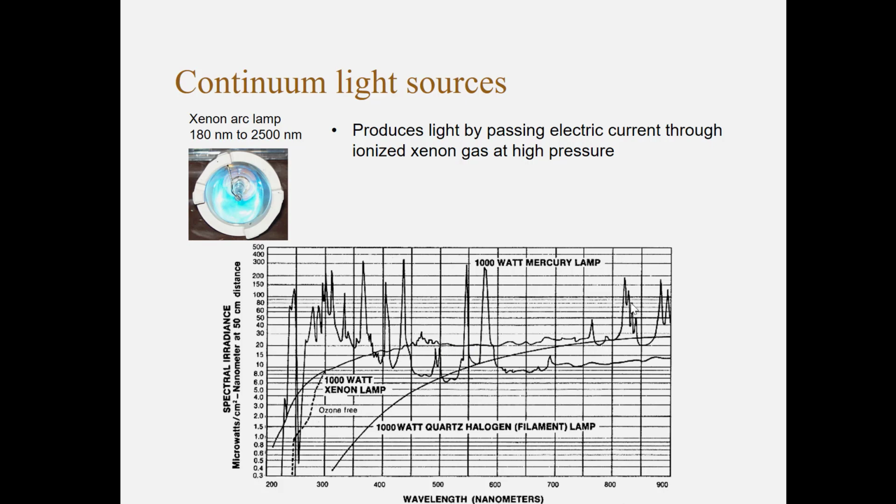And then when we come up to above 750 or so, we get a lot of spectral features again from emission from the xenon inside the light. Another benefit of this kind of xenon light is that the light inside it comes from a very small spot close to one of the electrodes. So that's where you have this very hot plasma which emits the visible light.